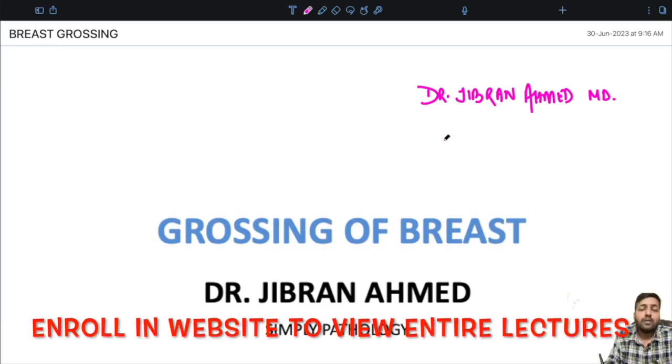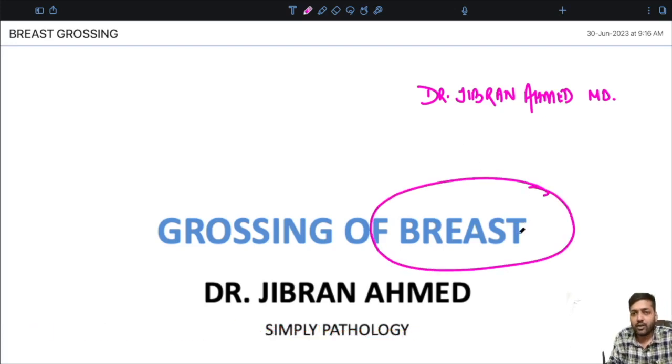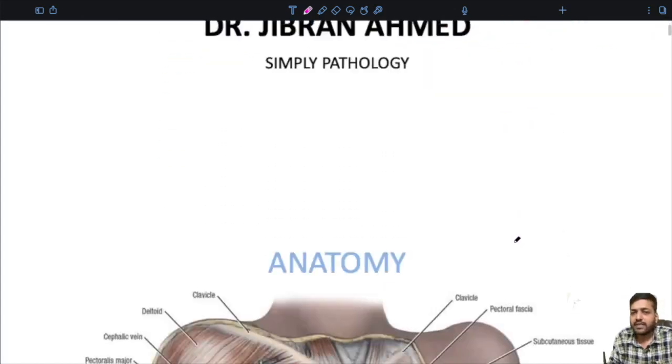Today we are going to start with the individual grossing modules, and today we will discuss the grossing of the breast. I hope you have seen the previous lecture on the basics of grossing before starting with the grossing of individual organs. So let us begin today's topic of discussion without wasting any more time.